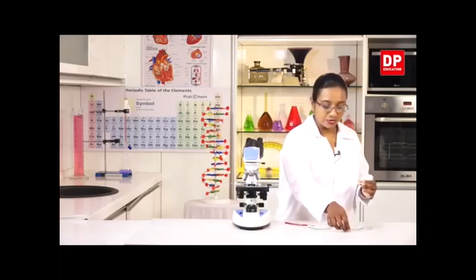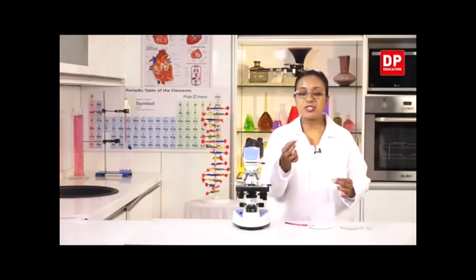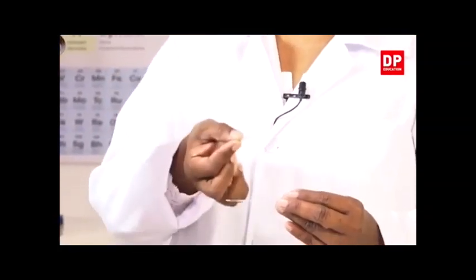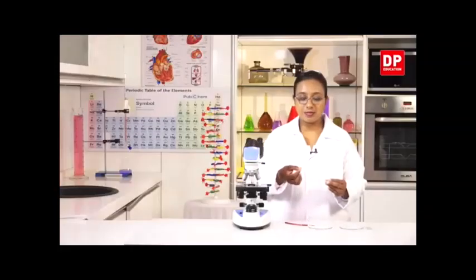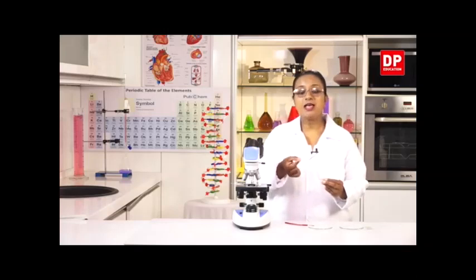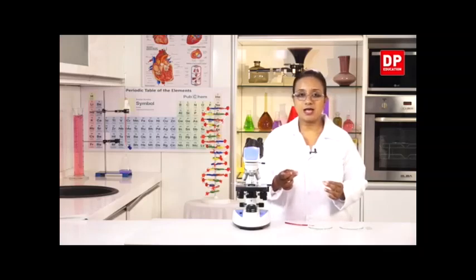And this, you know, is a smaller, thinner piece of glass which is known as the cover slip. We have to place the cover slip on top of the sample. So here, when we place the cover slip, we don't just put it on top. If we do that, there can be air bubbles trapped inside the sample. So therefore, we have to hold it at an angle and place it on the sample.